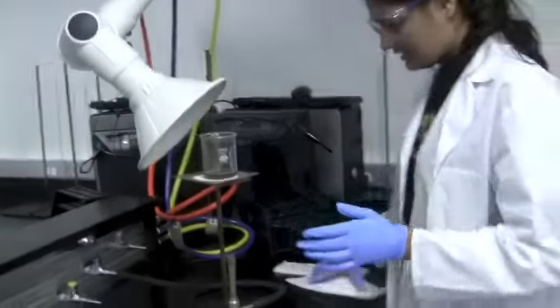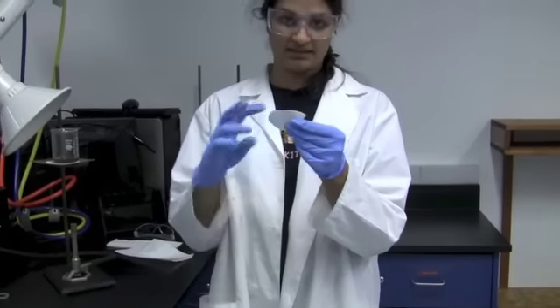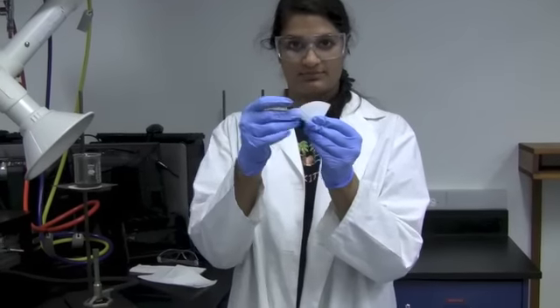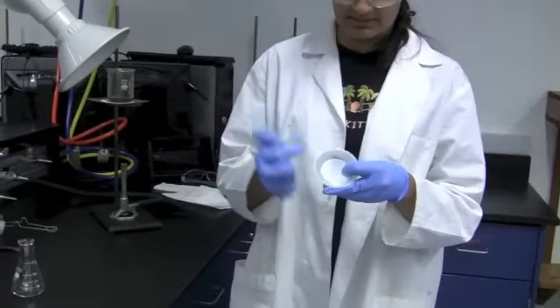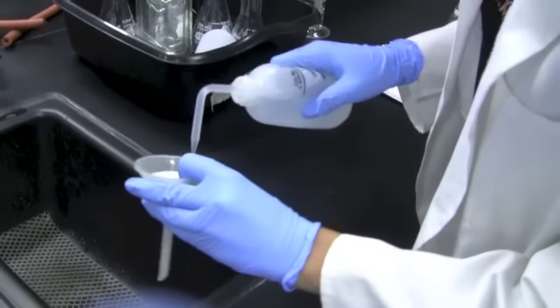To get rid of these, you're going to want to filter them out. Now, you're going to take some filter paper, you're going to fold it in half, and fold it in half once again to form a cone shape. You're going to open the filter paper and place it inside your funnel. And to get the paper to stick to the funnel, you're going to take your wash bottle and just lightly wet the edges.